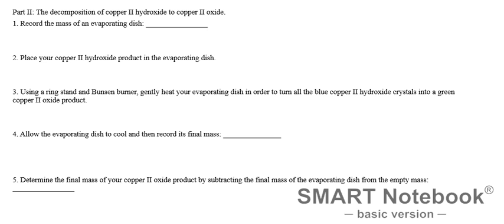We're going to start by measuring the mass of an evaporating dish. In my experiment I measured 26.15 grams. Then we place our product in that evaporating dish and gently heat it, then record a final mass when we're done. My final mass is 26.41 grams.